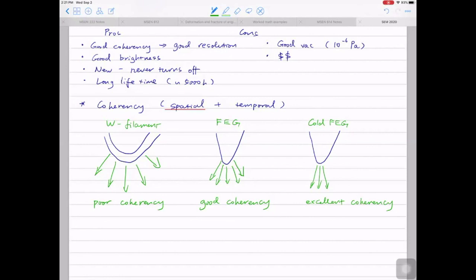It's much cheaper, and also maintenance, it's not that finicky. Plus, in terms of resolution improvement, you get some, but in most of the cases, you simply just don't need that level of resolution. If you're looking at, for example, nanoparticles, hundreds of nanometers, then maybe the regular FEG, like the Schottky, is good enough. But if you're looking at something super small, like super fine, tens of nanometers, then you need cold field, like cold FEG. About what resolution can each of them achieve?